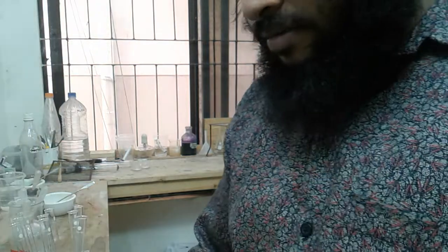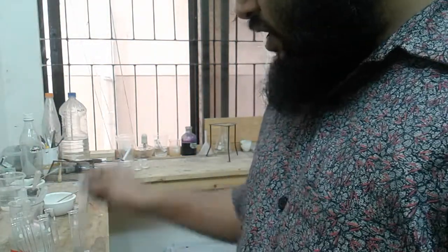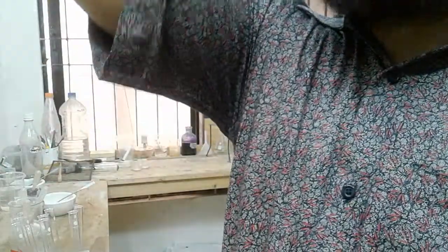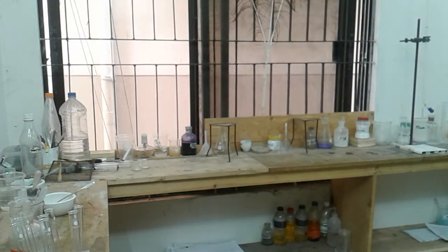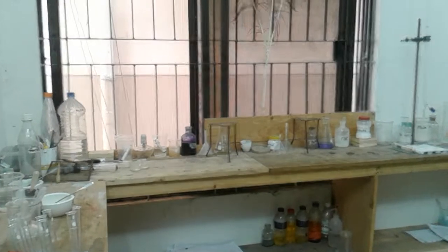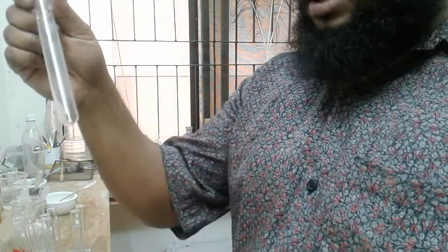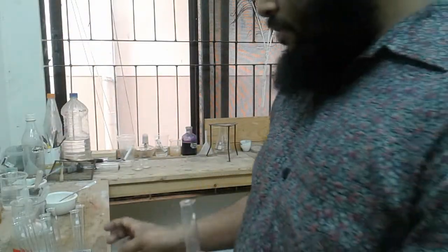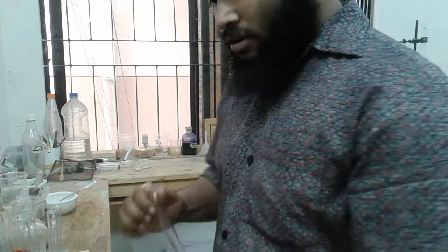Okay, now Fa1C says that you have to add sodium hydroxide dropwise until there is no further change. Okay, so I have cleaned the test tube. I am doing the test in the same test tube over again and again by cleaning it, because using a lot of test tubes will create a lot of hassle.